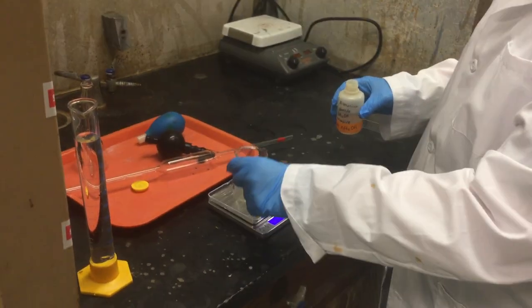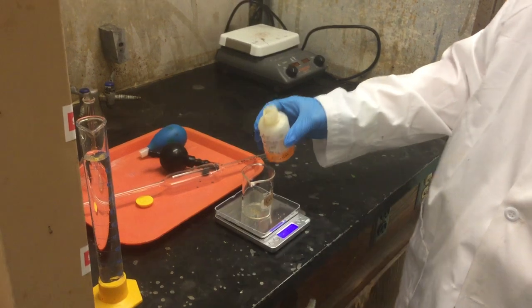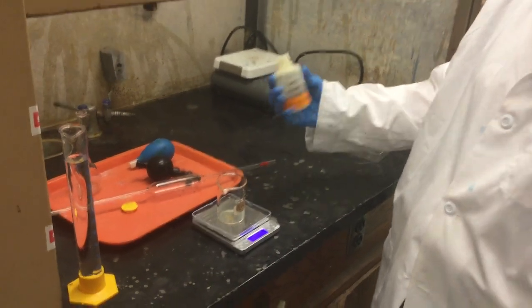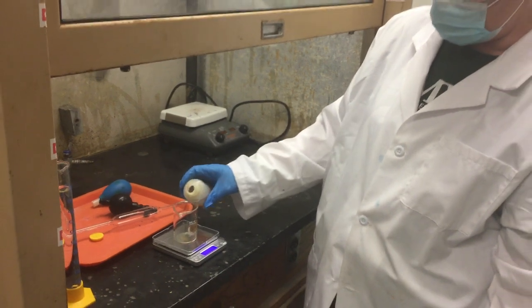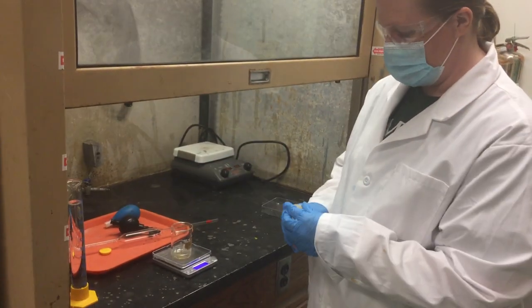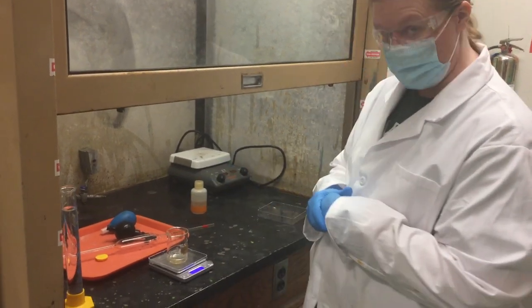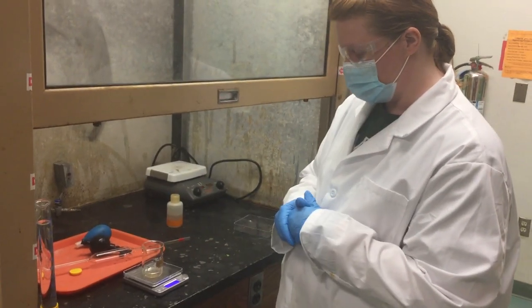If you have this plastic protective thing, you might be able to measure on here, but if you're prone to spilling, please don't — you don't want to dissolve our scales. You will calculate however much you're supposed to measure based on the pre-lab, and that's what you want to shoot for.